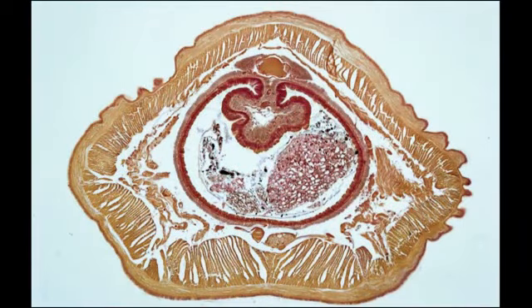Despite the differences in appearance, this is also a microscope cross-section of an earthworm. You can find all the same structures as in the previous specimen. The epidermis with its cuticle, circular muscle, longitudinal muscle, coelom, metanephridium, dorsal blood vessel, intestine. You can even see some food in the intestine here. The typhlosole. Down here is the ventral blood vessel and the nerve cord.